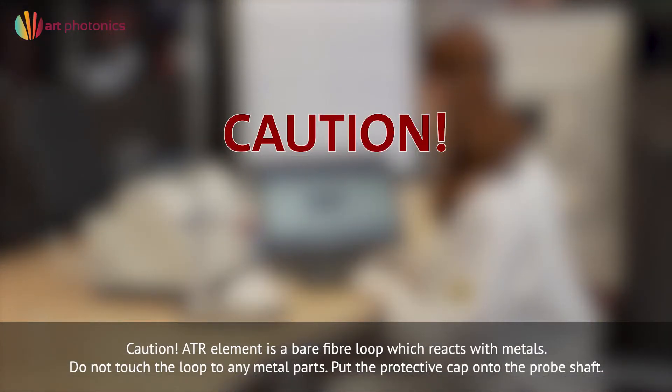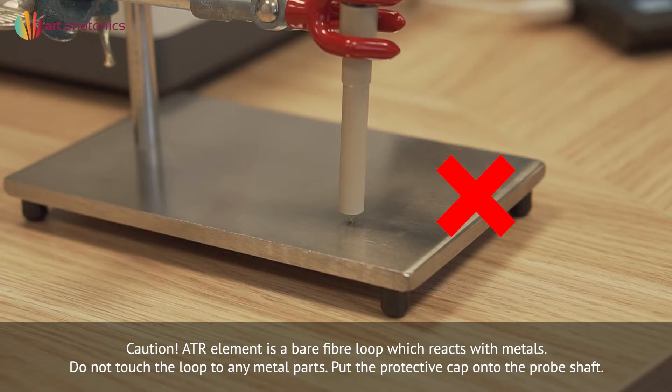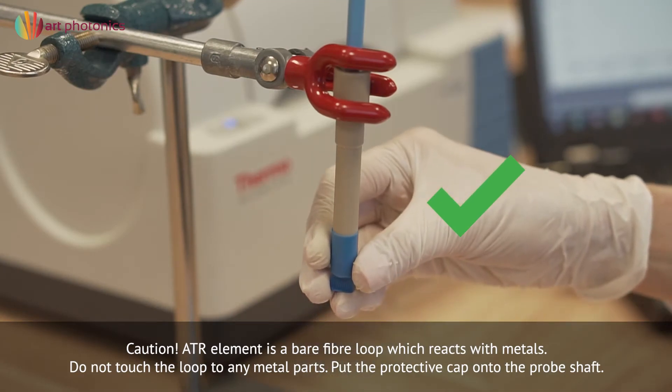The ATR element is a bare fiber loop which reacts with metals. Do not touch the loop to any metal parts. Put the protective cap onto the probe shaft when not in use.